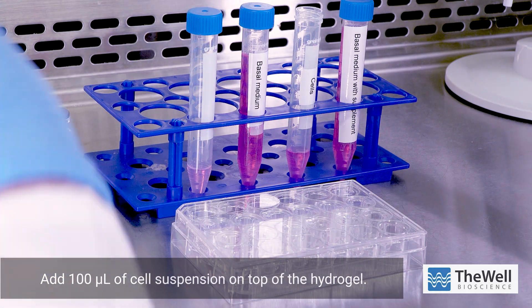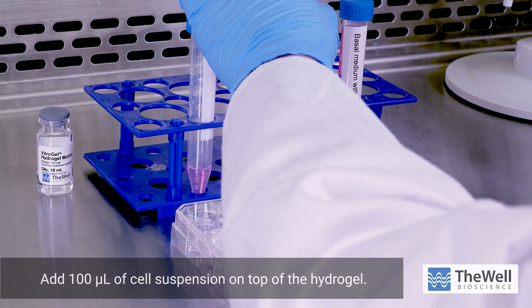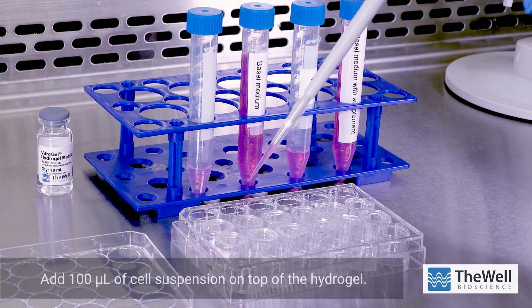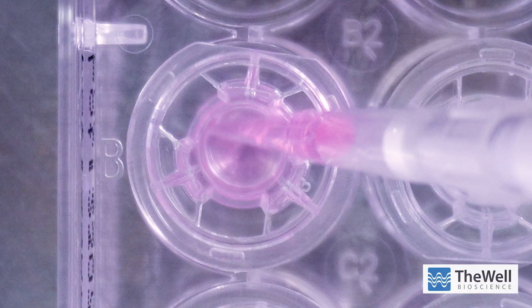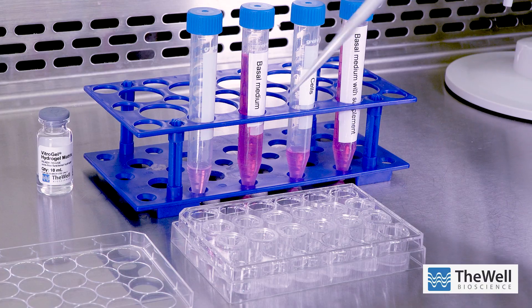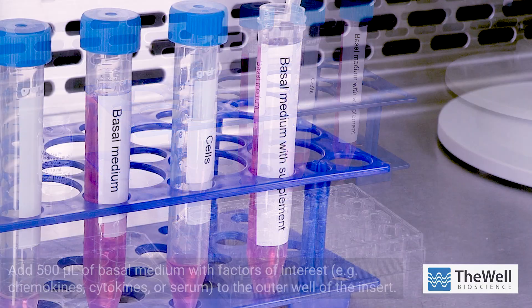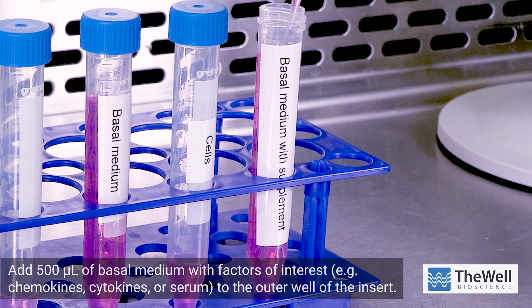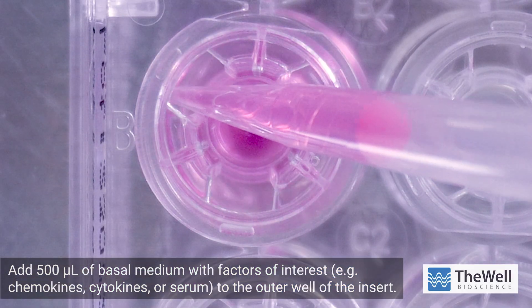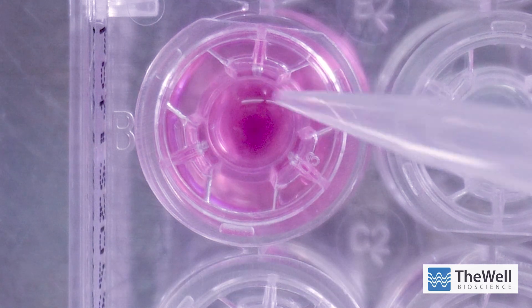After incubation, add 100 microliters of cell suspension on top of the hydrogel. To the outer well of the insert, add 500 microliters of basal medium supplemented with factors of interest such as chemokines, cytokines, or serum.